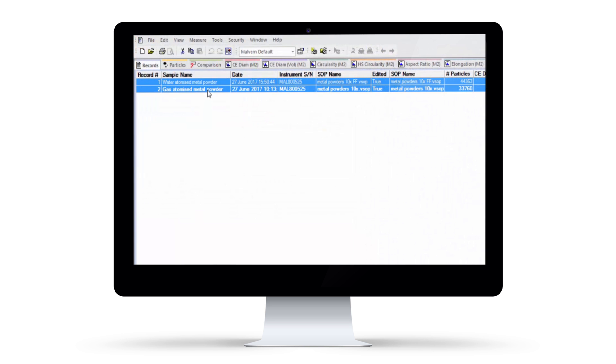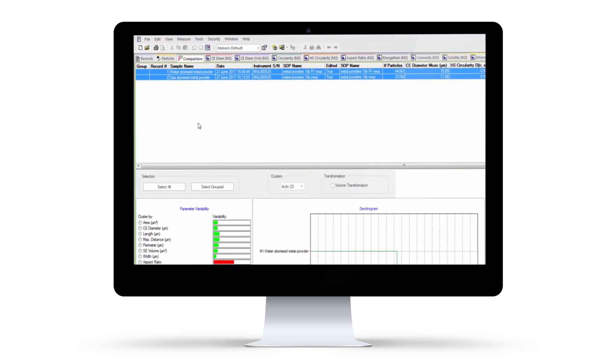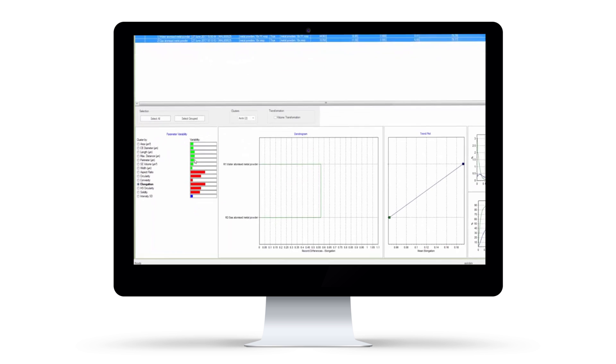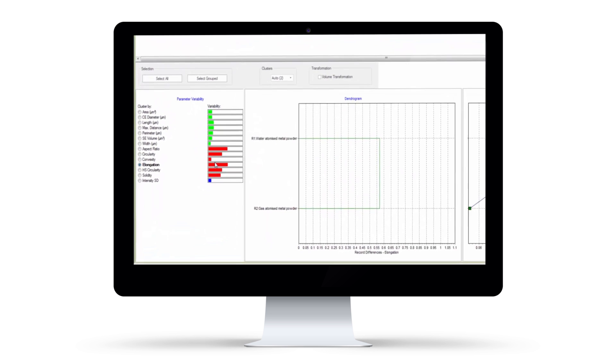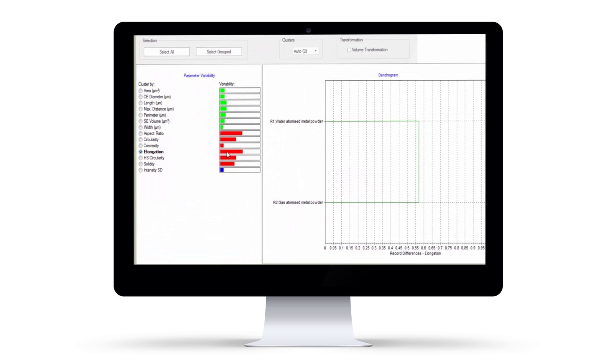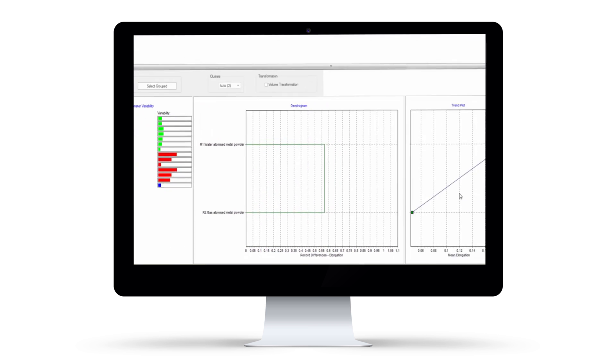Integrated intelligent algorithms can then identify the morphological parameters which best differentiate between batches.